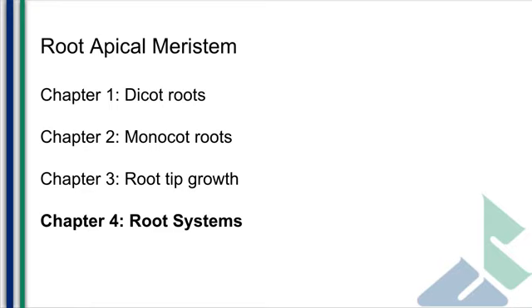For the last section of the lab here, taking a look at some root systems, hopefully you've had a good time drawing the structures under the microscope, so I want to end by looking at things from a macro level scale, how these roots look like when you pull the plants out from the ground.